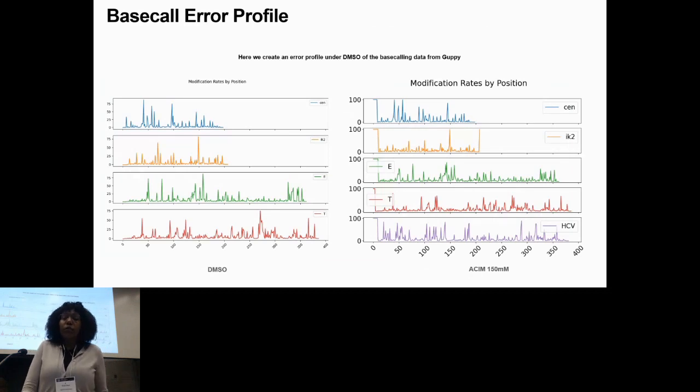So to better understand these changes, what we really have to do is look at the kinds of base call errors that we're seeing in correlation with the concentrations of the structure probe that we are using. When we measured these, obviously acetylimidazole created the most significant structural changes. I have to also say that at lower concentrations, it wasn't quite as significant, and it was hard to detect it from unmodified. So you have a significant amount of background noise that you need to account for when you're using these probes.